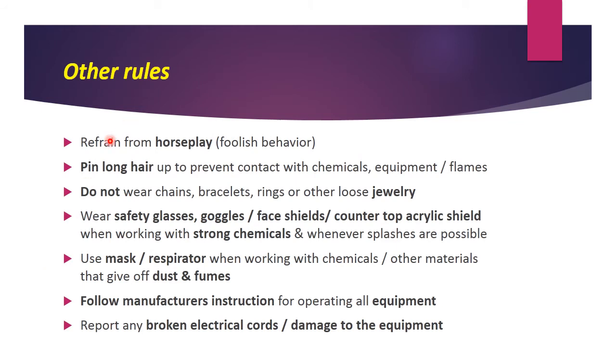Other rules like refrain from horseplay. That means avoid foolish behavior in the laboratory, like pushing others or mishandling the laboratory wares. All these things should not be done in the laboratory. Pin long hair up to prevent contact with the chemicals, equipment or flames. So you have to pin up your hair and not allow it to come in contact with these things.